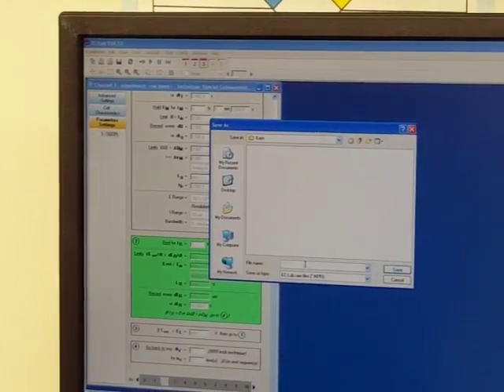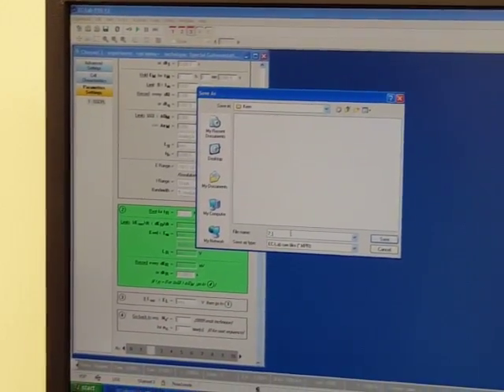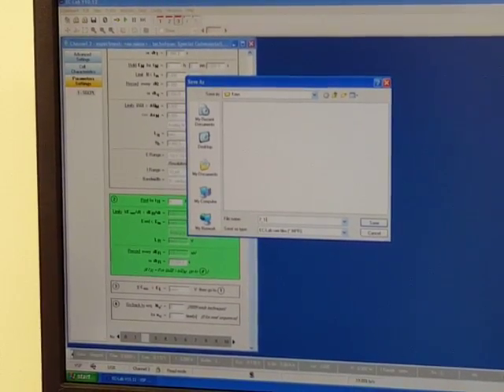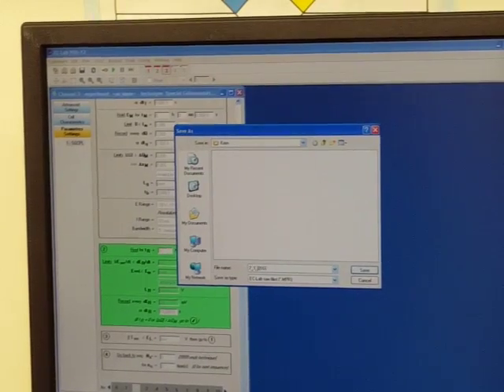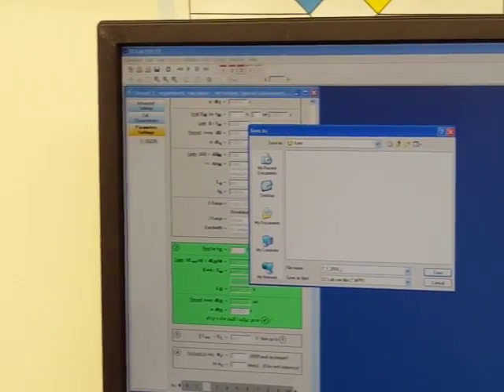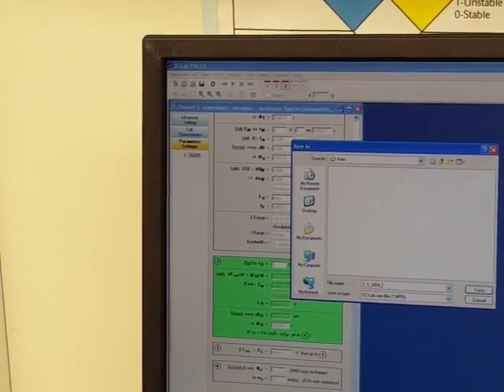The way that we name our experiment is always like this: 7 underscore, this is just the date, 1 underscore 2016. All right. Oops, not dash, underscore. So we always start it with the date. Does that make sense? And I'll give you a book where you're going to be recording what's going on.